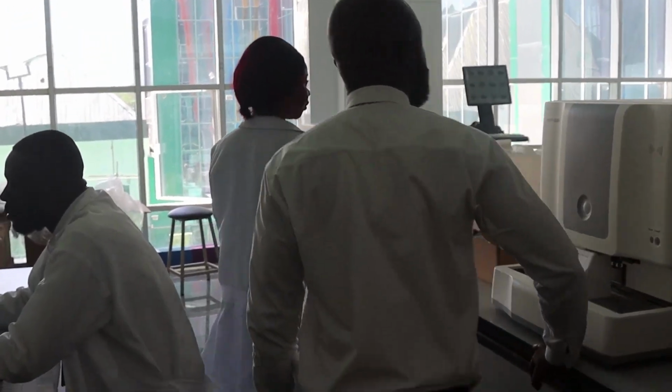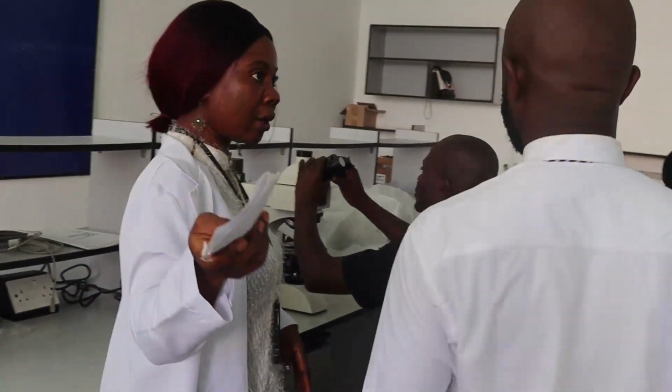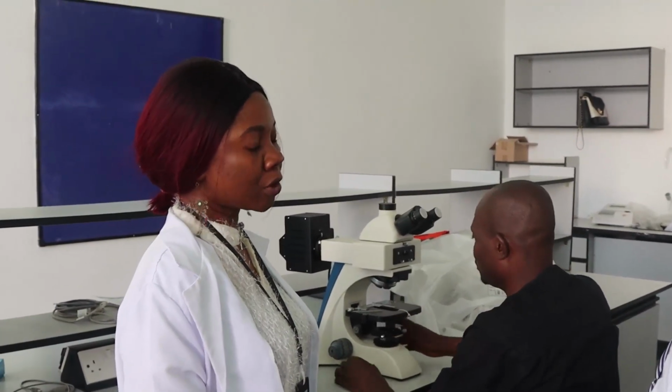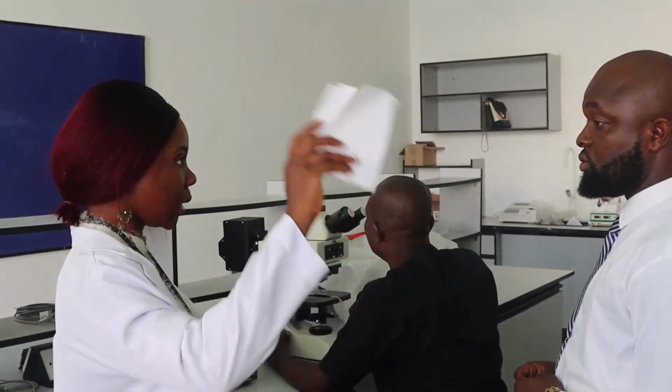Do you have another? Yeah, we have different types. We have so many of them. Some are in the store. We can't bring them here. We have the electron microscope and we have the light microscope. Does it do the same thing? Yeah, the electron microscope basically uses electrons for its function, while that of light uses light.